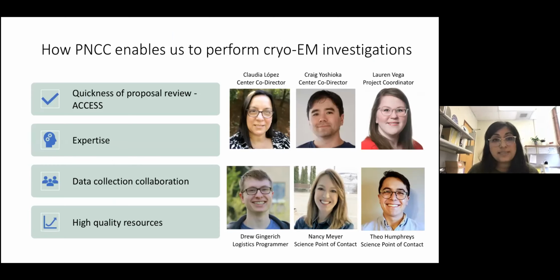So how does PNCC enable us to perform cryo-EM investigations? Well, the proposal review process is absolutely phenomenal. It's very informative, and it's also quite quick. So although there's a formal process for applying, within 2 to 4 weeks of review, you have an answer. And as soon as your samples are ready, within 2 weeks after that, you're able to get into a queue.